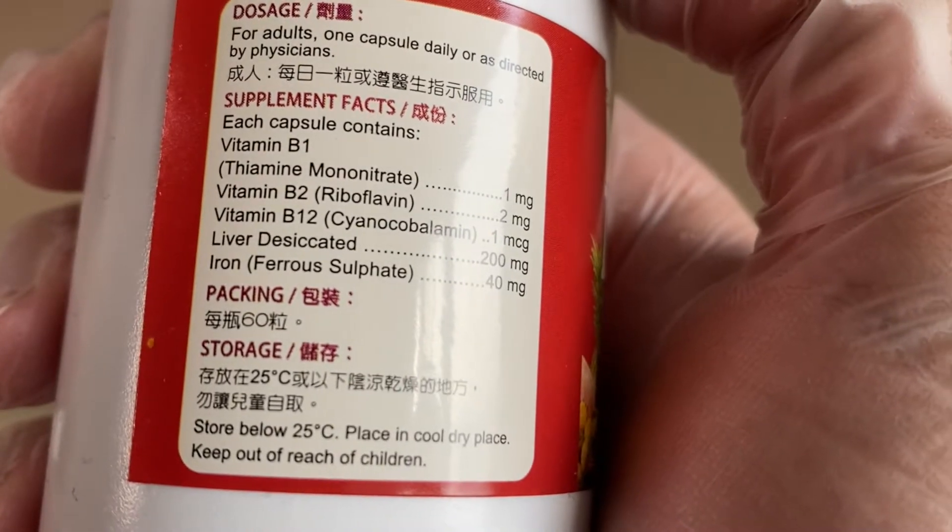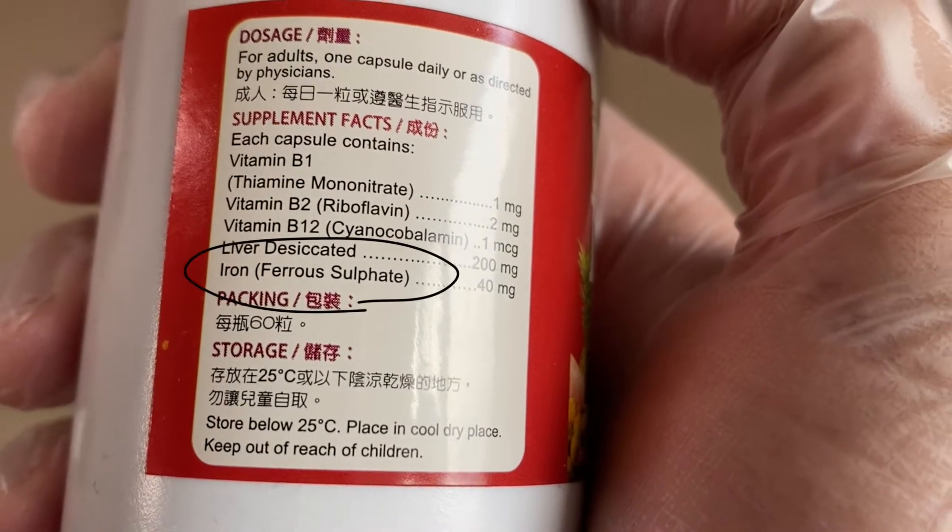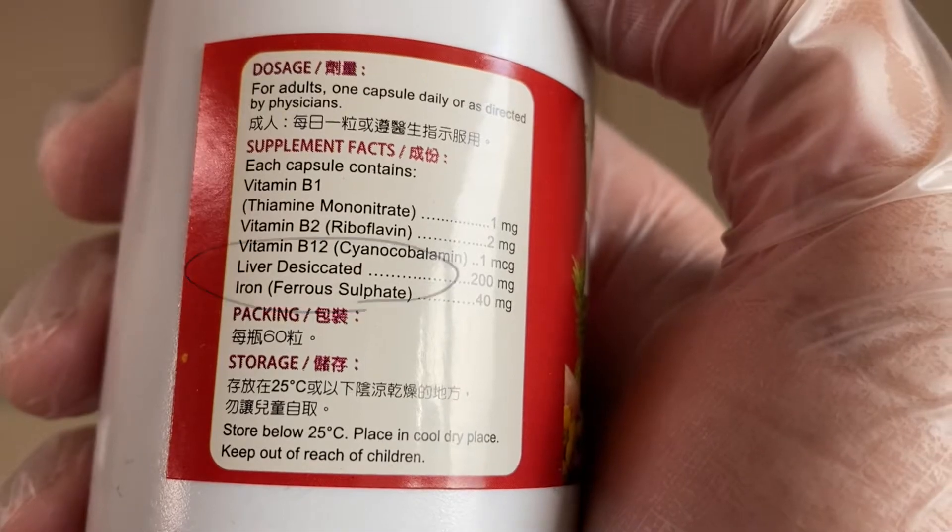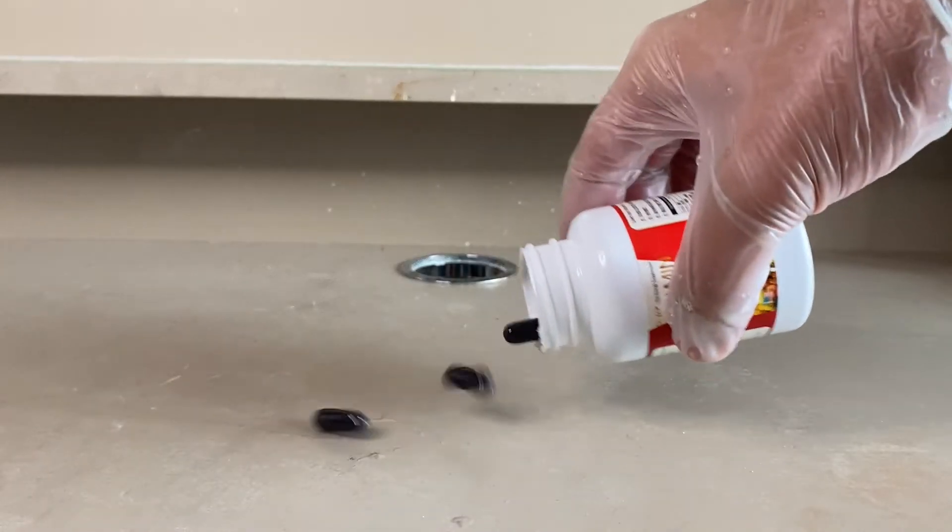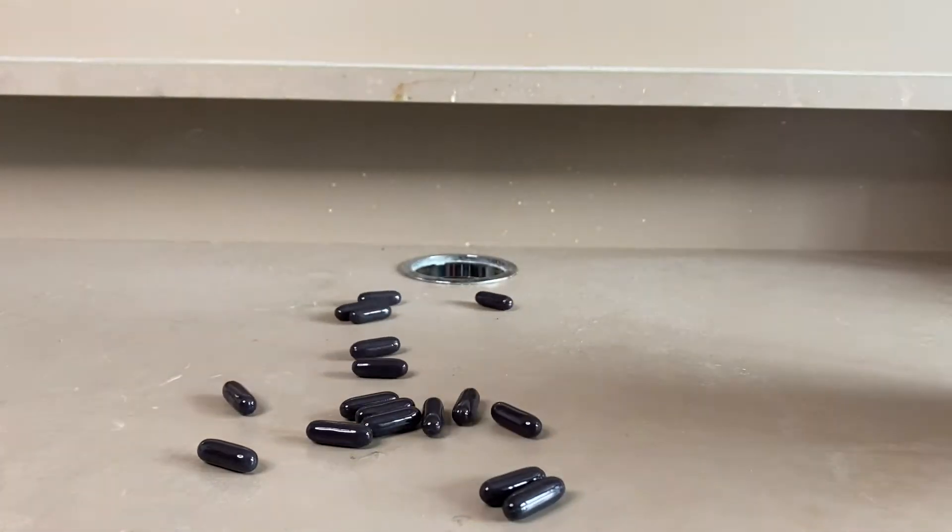One of the ingredients in vitamin pills is iron in the form of ferrous sulphate and today we're going to extract it and turn it into metallic iron.